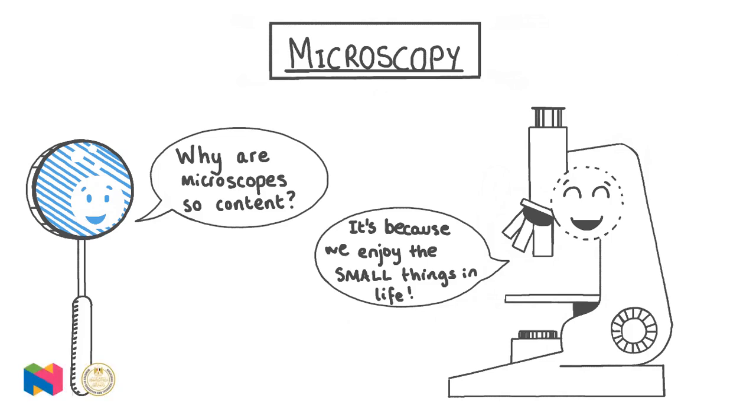In this video, we will learn how to compare and contrast different types of microscope and identify the type of microscope used by the image it produces. We will first outline the structure and features of a light microscope and learn how to calculate their total magnifying power. We will also learn what the terms magnification and resolution mean and compare these features in three different types of microscope: light microscopes, transmission electron microscopes, and scanning electron microscopes.